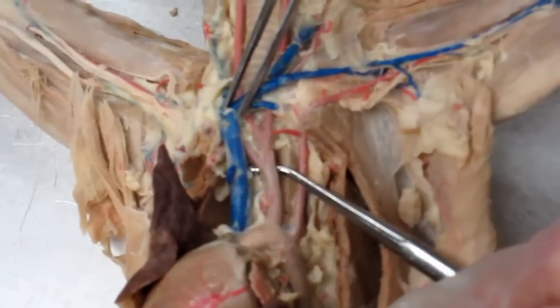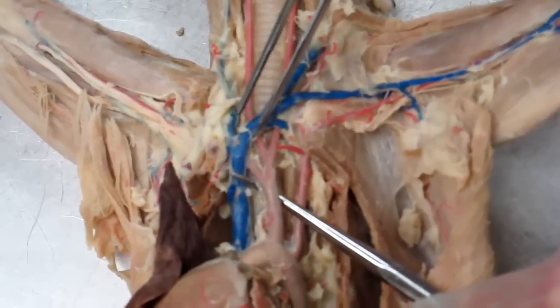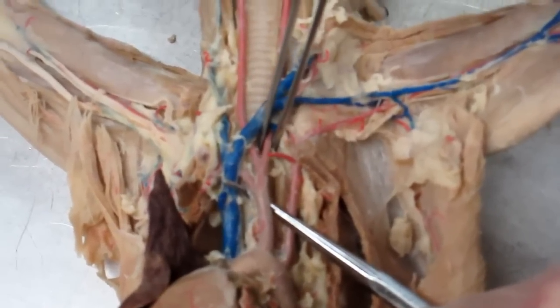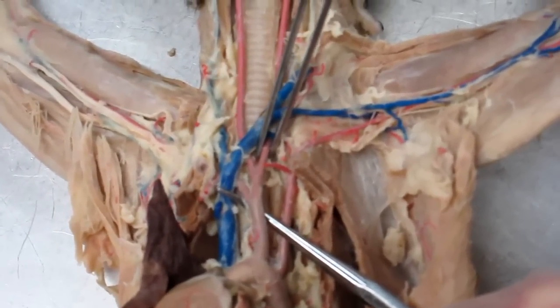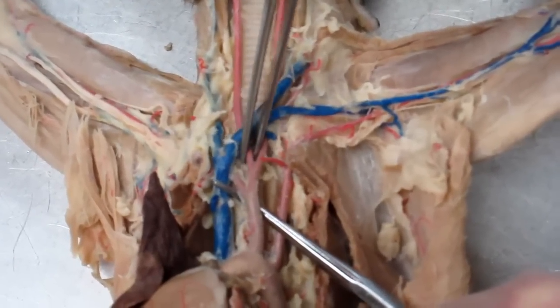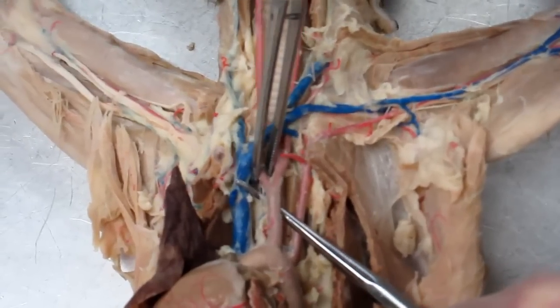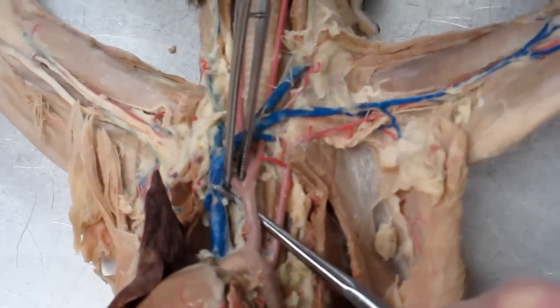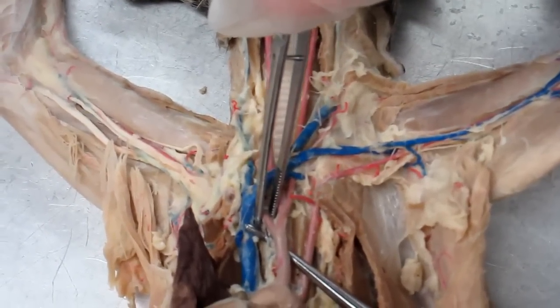Okay, and as we move the blue vessels, these veins out of the way, you can see that the brachiocephalic divides into three separate vessels. Here's our left common carotid, closest to the left subclavian. Then the right common carotid, next to the right. And then the last branch here, the third branch of the brachiocephalic, is the right subclavian.